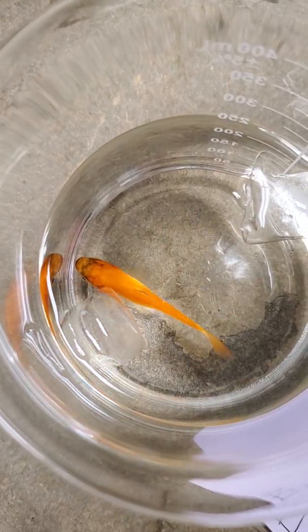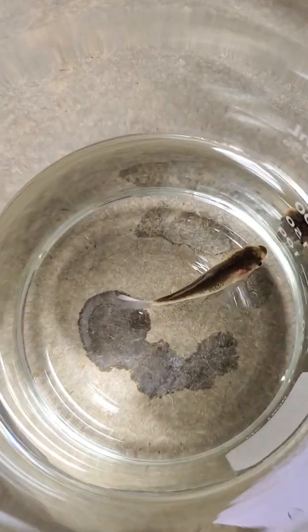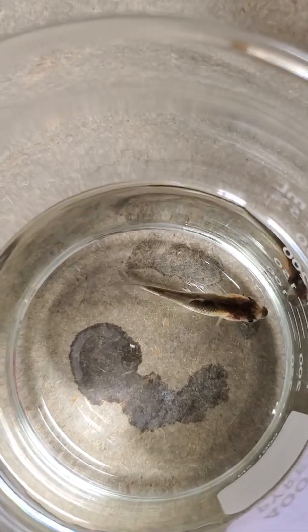And time. Okay, now we're going to move back to our control. It is 18.1 degrees Celsius. And start counting his respirations.